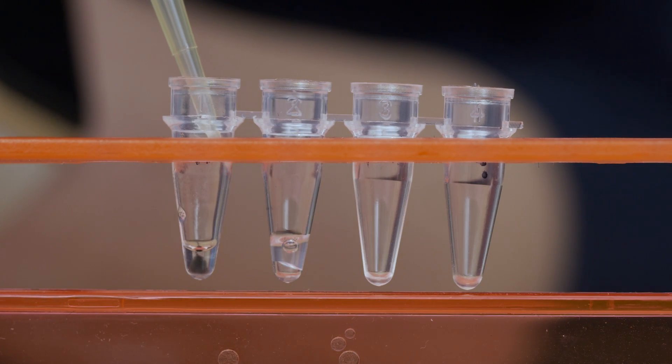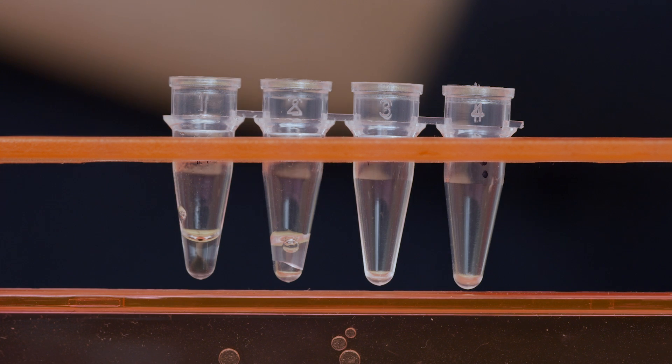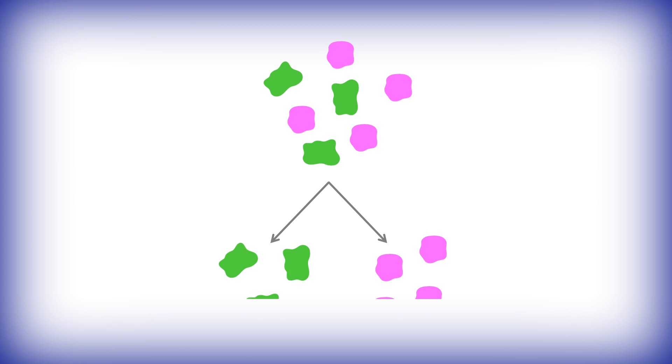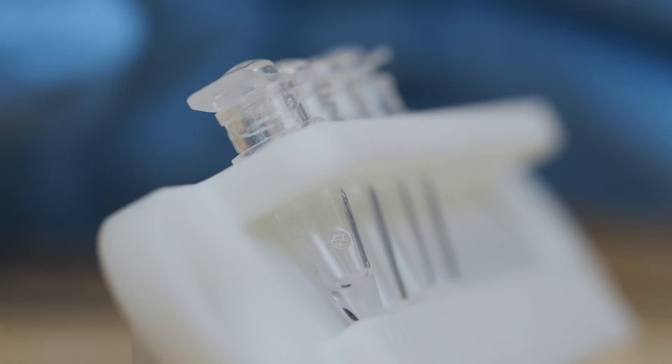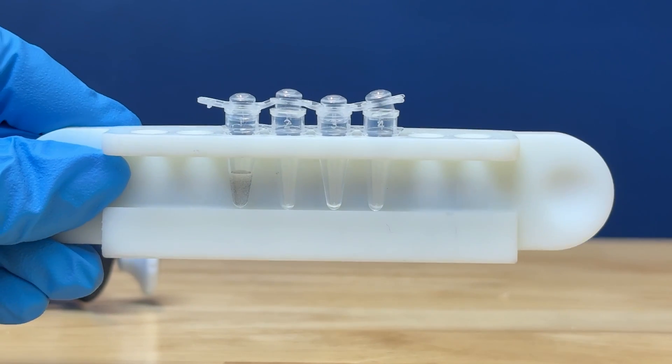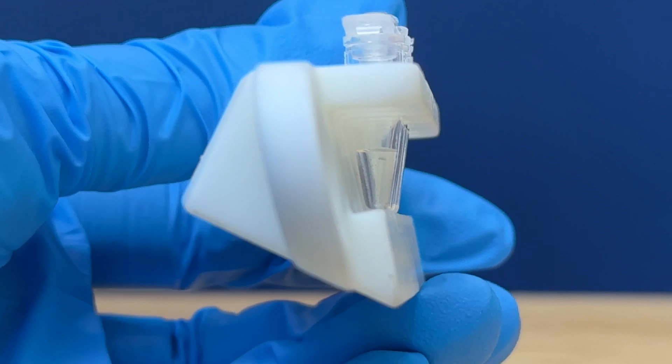In the second half of the lab, students use affinity purification to separate a mixture of the red and green fluorescent proteins. The protocol uses small magnetic beads and strong neodymium magnets in the MiniPCR Bio Pulit magnetic rack to capture the green fluorescent protein.